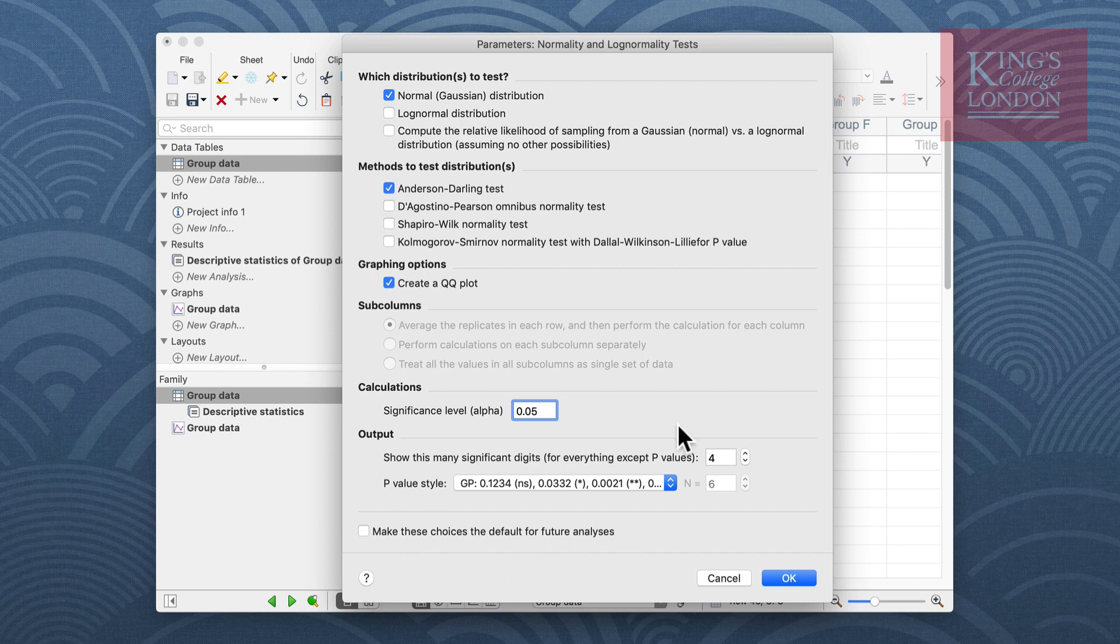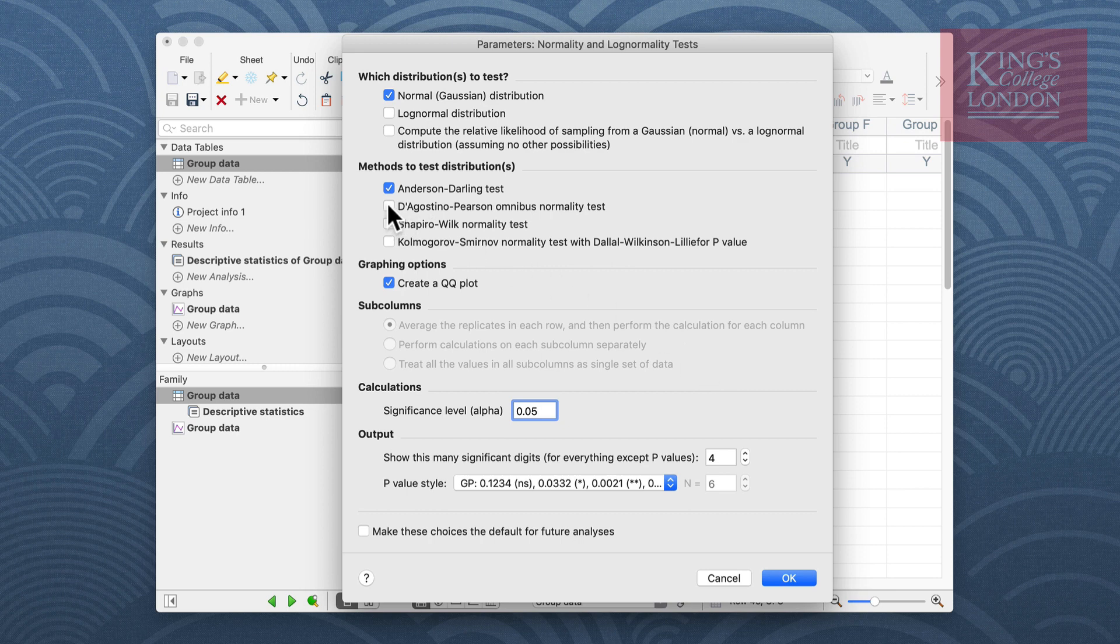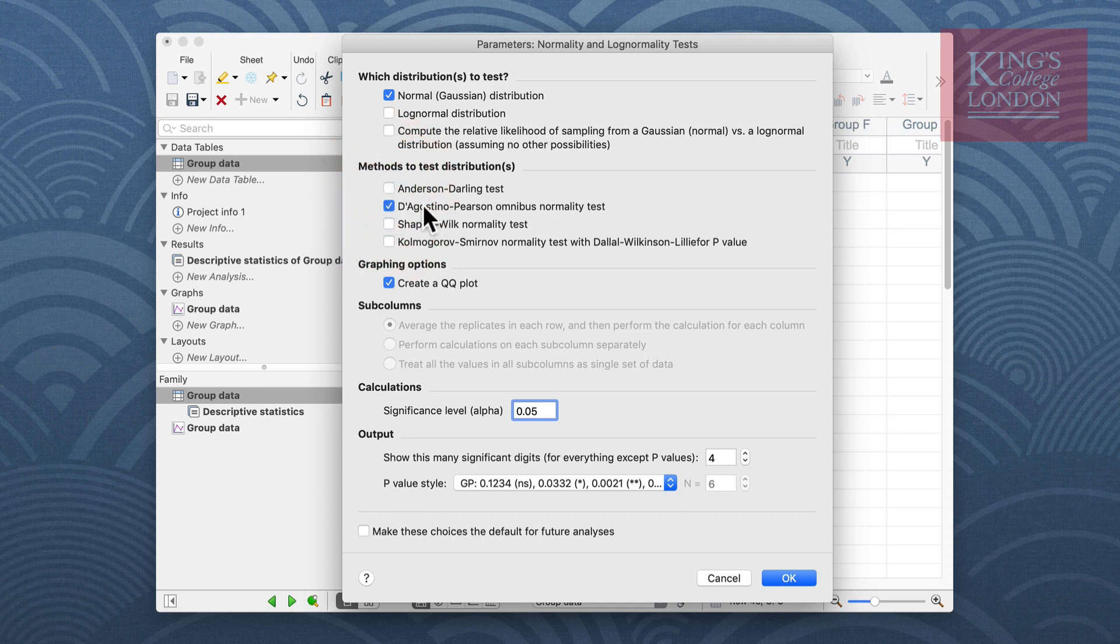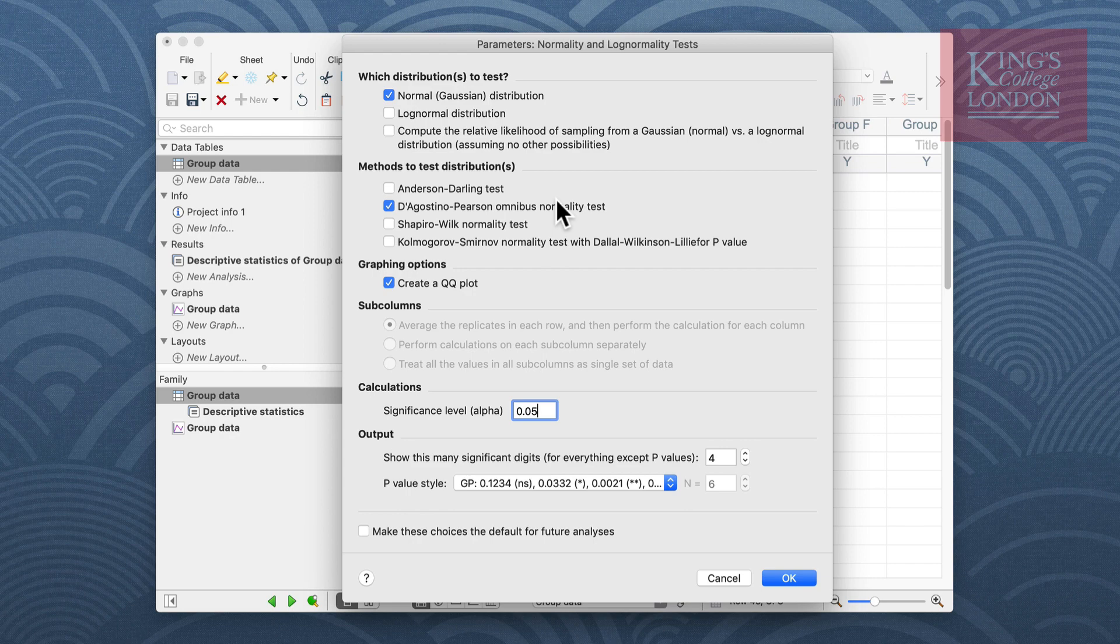However, I want to do a normal distribution test using the standard D'Agostino-Pearson normality test, so I select this one from our list and I continue with the tests by pressing the OK button.